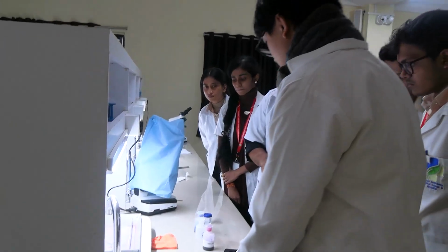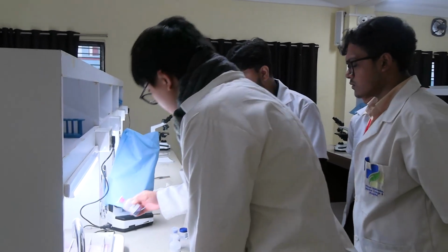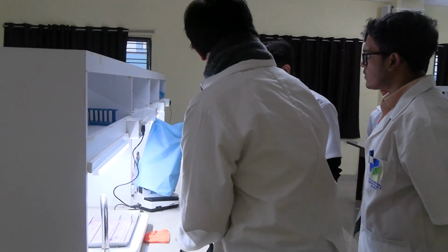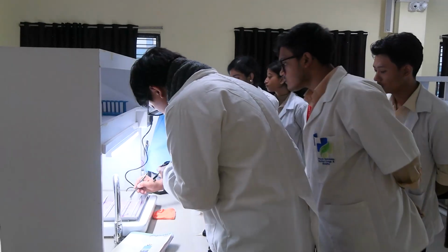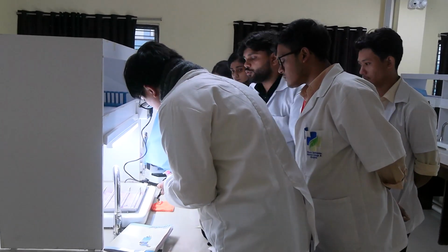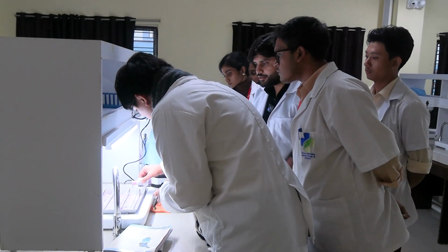Let's start. What is the first step? Carbol fuchsin. You're going to pour it over this. Wait a minute. So how much? You have to flood the smear. The smear is this one, circled by the marker. Can you see this circular thing? This is the smear. So you have to pour it only over the smear. You have to sometimes push the bottle hard. Okay.